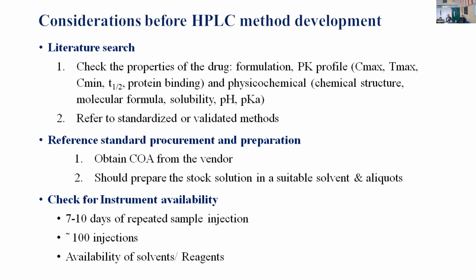We should prepare some stock solution and divide it into suitable aliquots, and we need to check the instrument availability for the next 7 to 10 days. We also check the column life for 100 injections, and also need to check the availability of solvents and reagents.